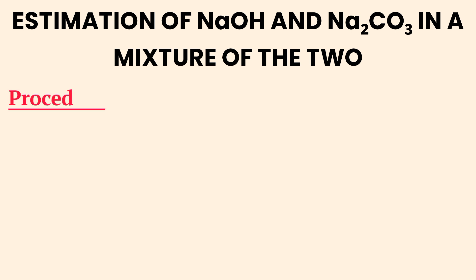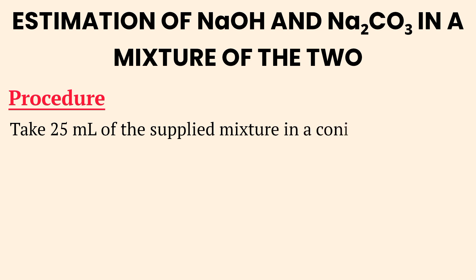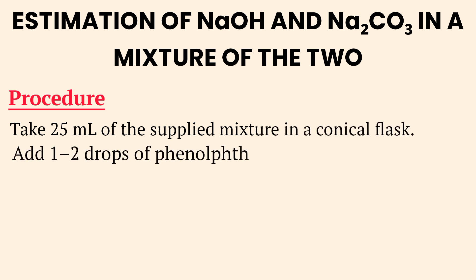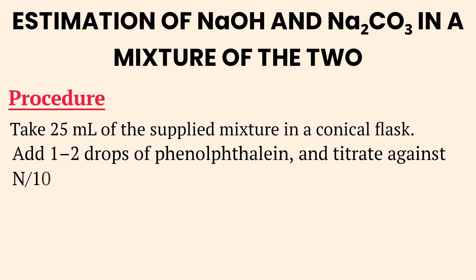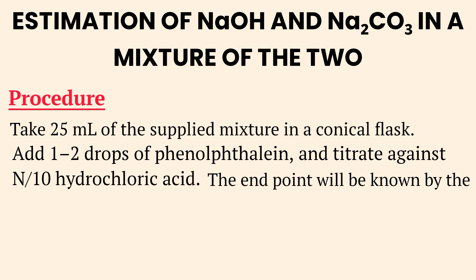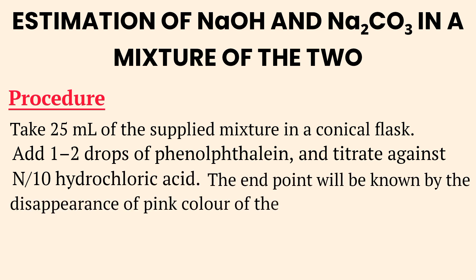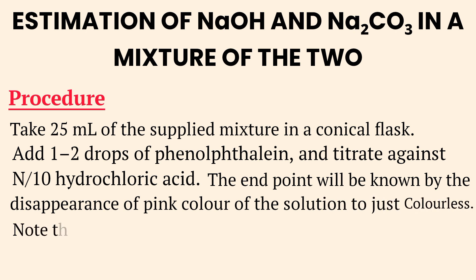Procedure: Take 25 milliliters of the supplied mixture in a conical flask. Add one to two drops of phenolphthalein and titrate against standard hydrochloric acid. The endpoint will be known by the disappearance of pink color of the solution to just colorless. Note the endpoint.